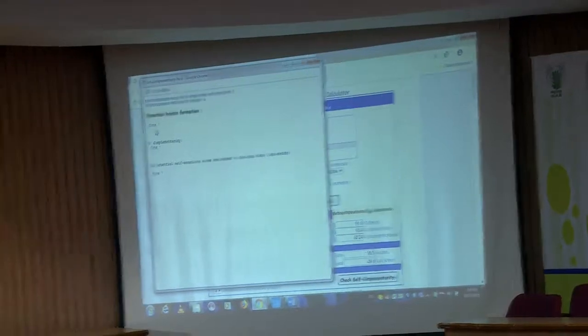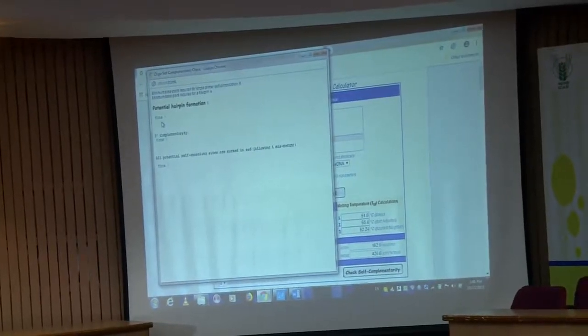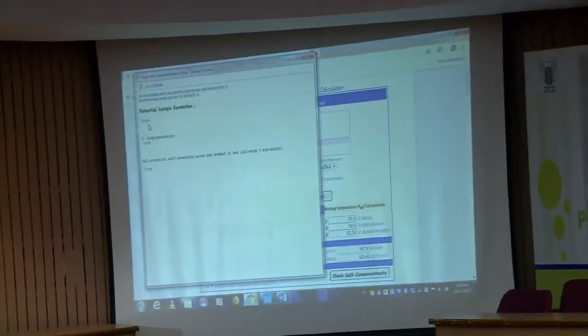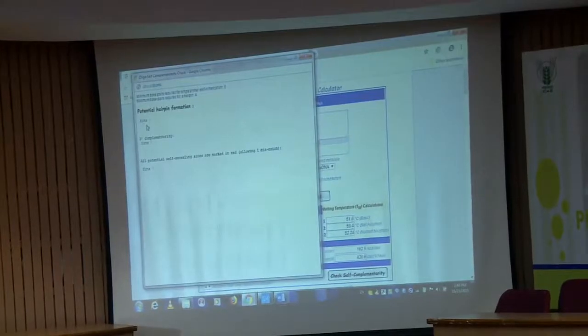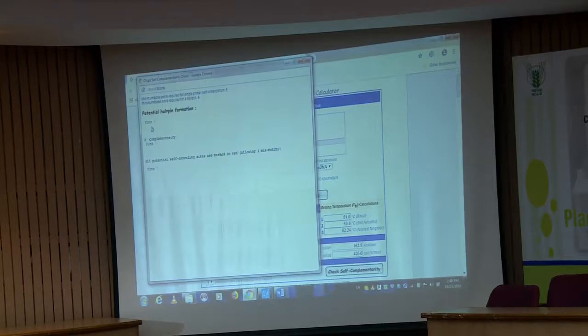You send it to the company people who are synthesizing the primers for you. They will give you the primer in a particular concentration, some nanomolar concentration. Generally, they provide the lyophilized form of your oligonucleotides, right. So, they will deliver it to you, then you resuspend according to the concentration which the company provides. The stock solution, always make it 100 picomole per microliter.